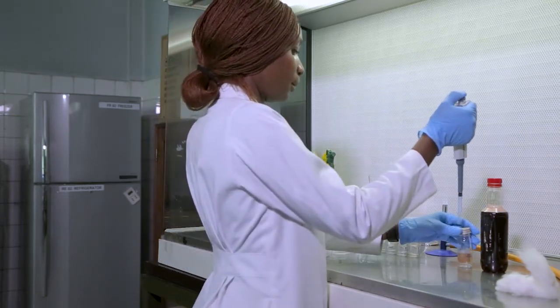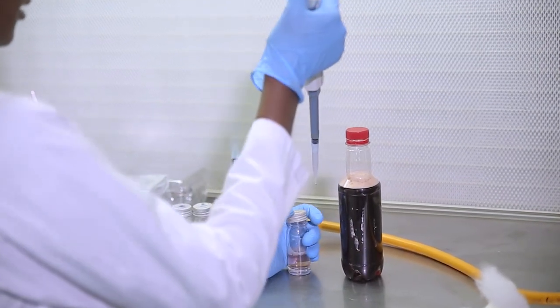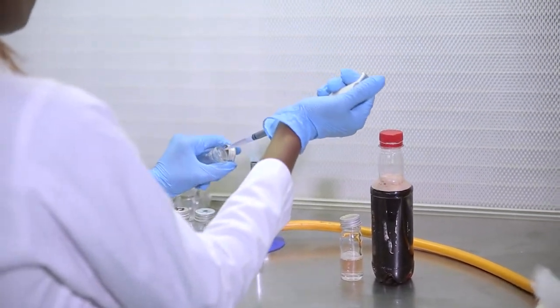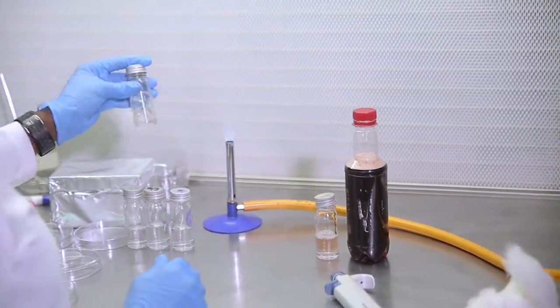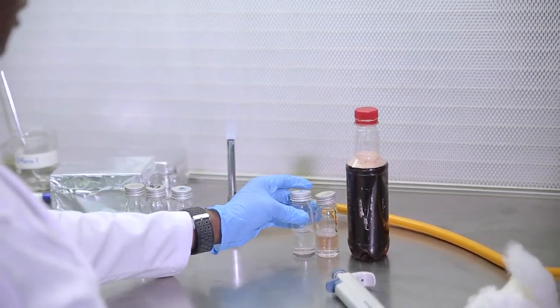I'll pick 1 ml of the sample. Okay? And then I'll deliver it. You work close to a flame to avoid any form of contamination. Shake this thoroughly. If you have a vortex, for about 5 to 10 seconds.